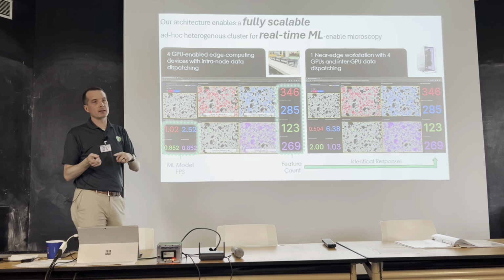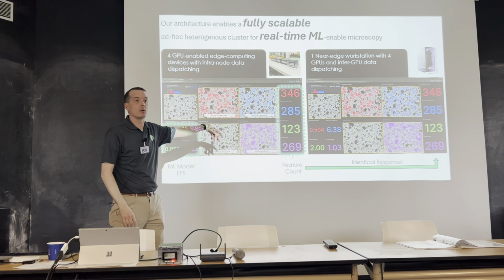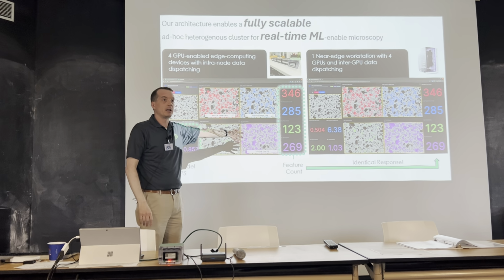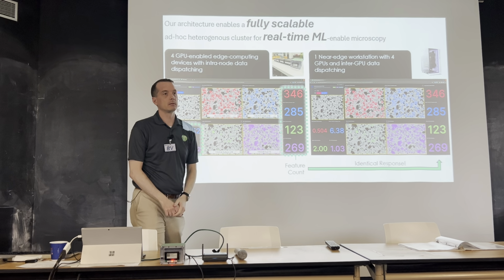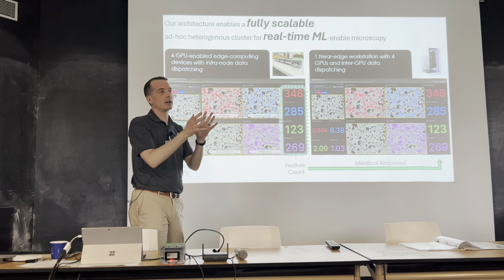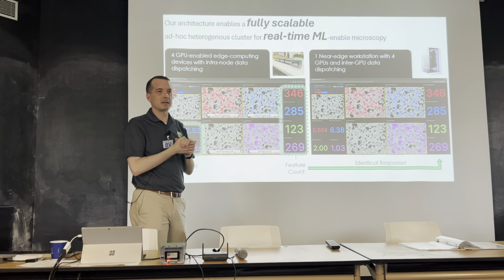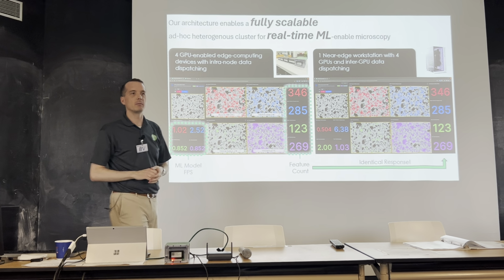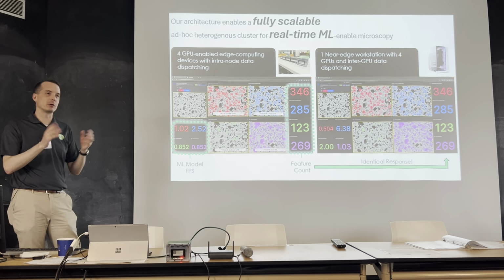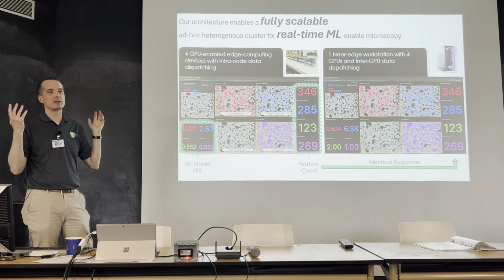Then we throw that onto the device and then we run a whole separate set, which would be like the videos or an actual experiment, and they decide, is that going to work or not for what they're getting. There's a graduate student at University of Michigan whose thesis work is basically how good are the models and what are they seeing and how does that all work? And to answer that question mostly, because there has been pushback, of course, of like, how is that model as good as a trained microscopist?